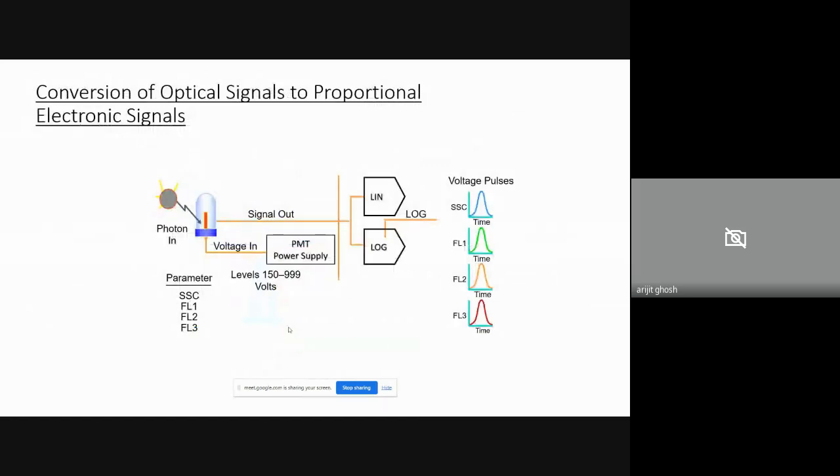Now, how the optical or analog signal is digitized is shown here.